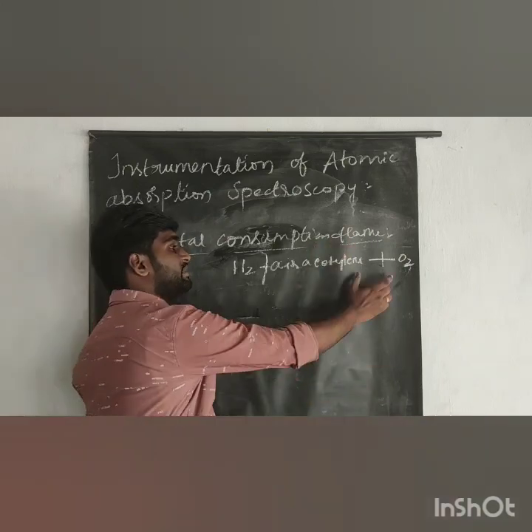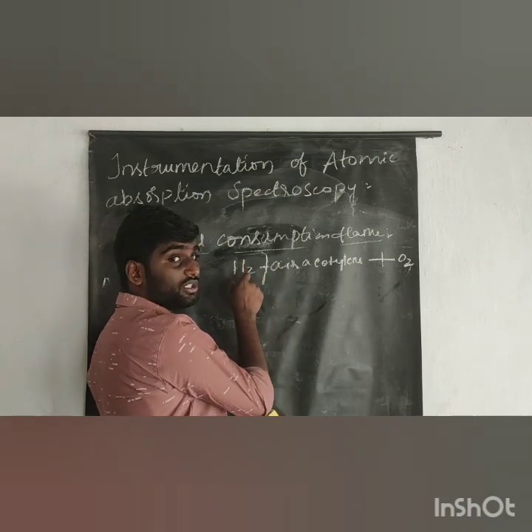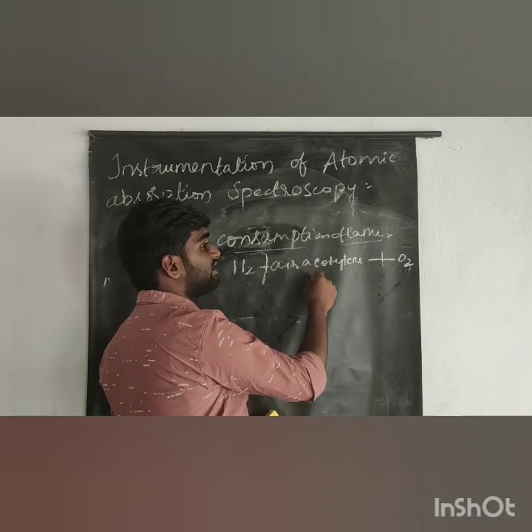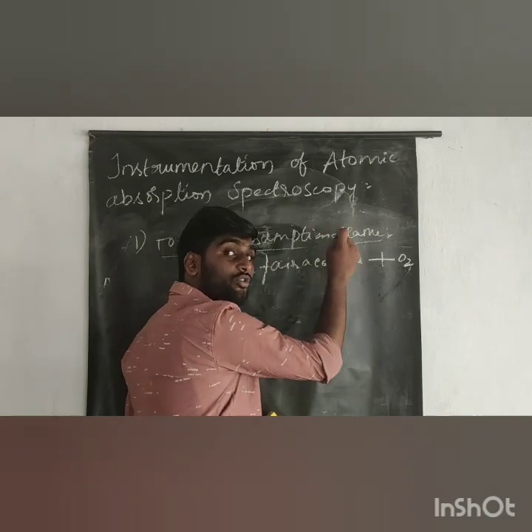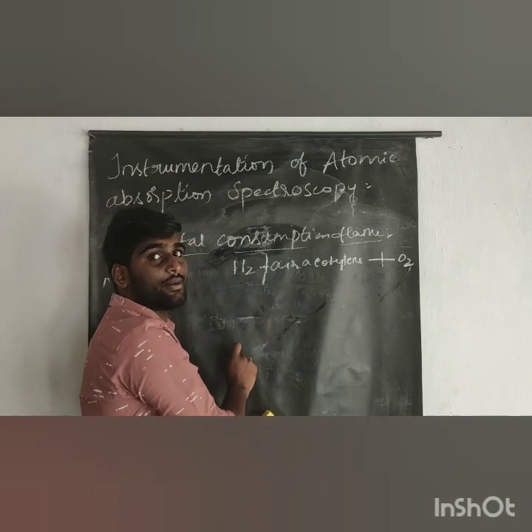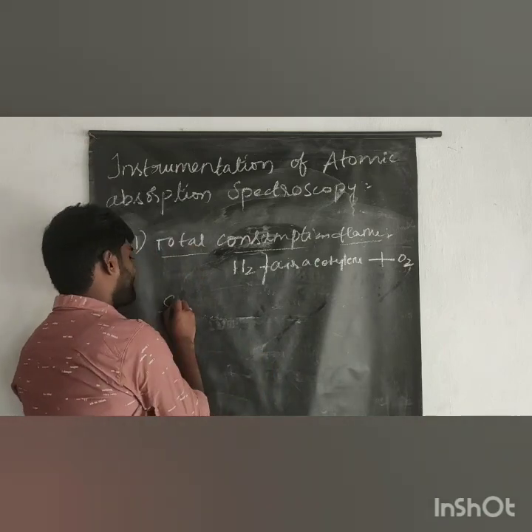So this mixture, when it burns at the top of the burner, the flame will be produced. Okay, so the hydrogen or air acetylene is combined with oxygen, and it burns at the top of the burner, and here the flame will be produced.